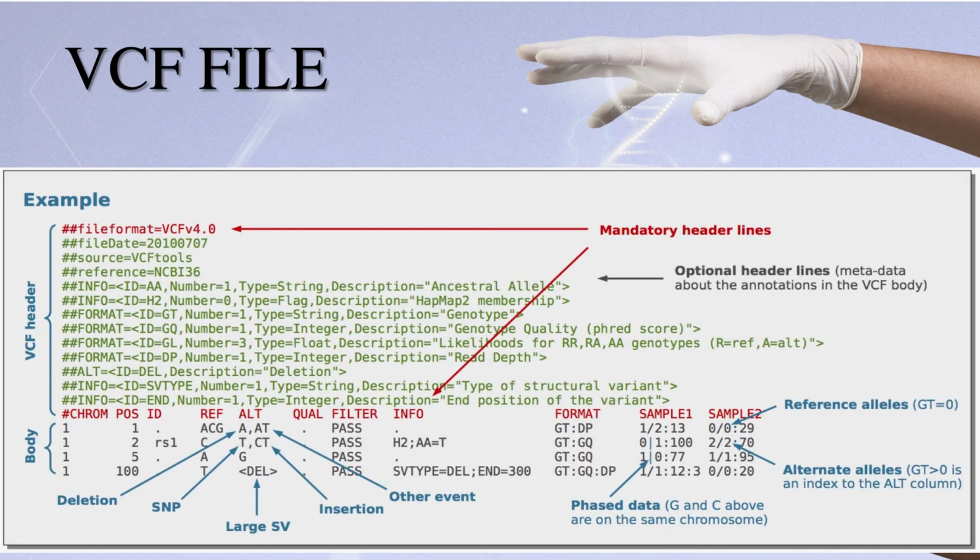Let's go through a detailed version of a VCF file. Upon opening a VCF file, the initial view typically resembles the following. The first few lines constitute the introduction to the VCF file. A VCF file, in essence, is organized into three distinct sections. The foremost section comprises metadata lines, constituting the initial lines of the file. These lines, denoted by a prefix of two pound symbols, serve as the preamble to the VCF file and encapsulate critical information about the file's format and content.